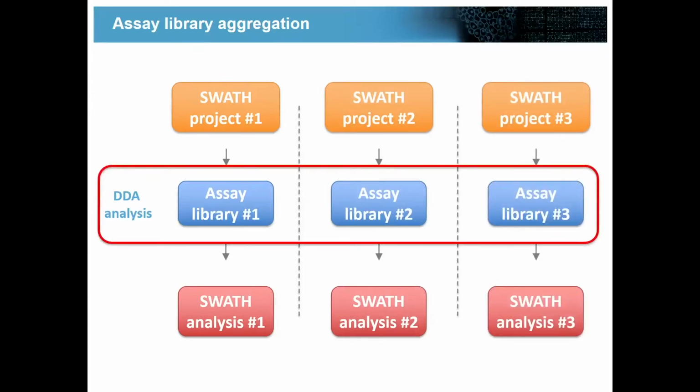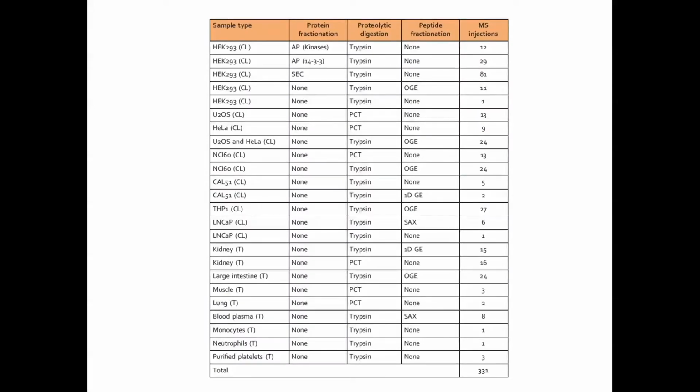And then eventually we said, well, maybe we should try to make a collection of these spectral libraries and just consolidate these, and hopefully we might be able to eventually leave this step out of this particular pipeline if we just accumulate enough information. And so this is an example of that.